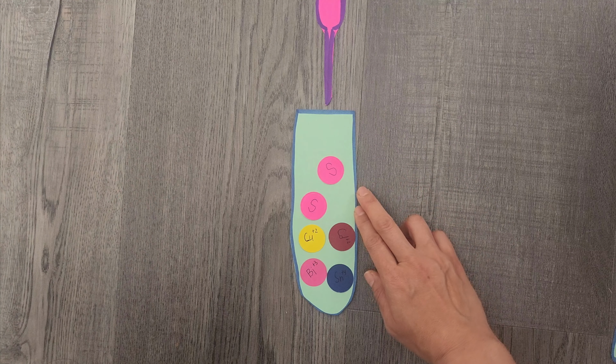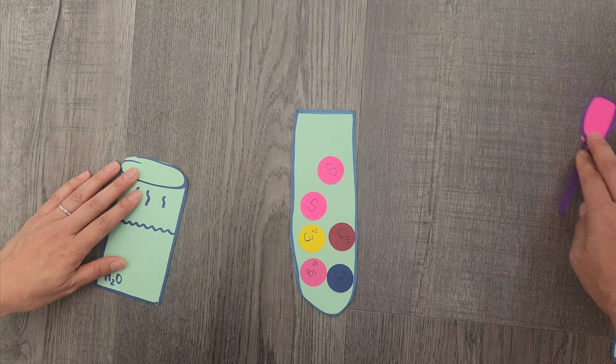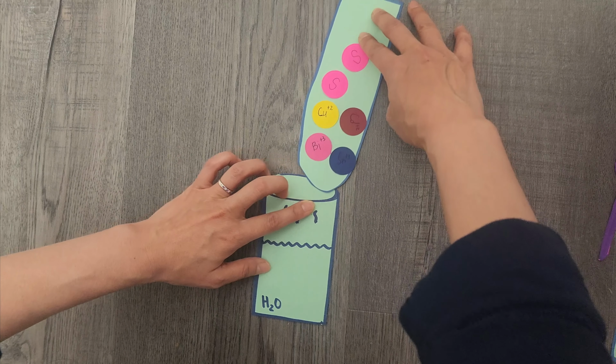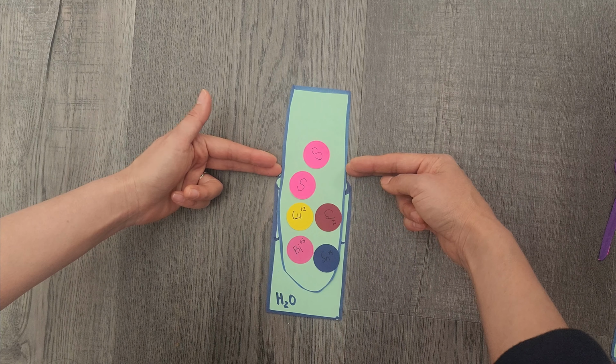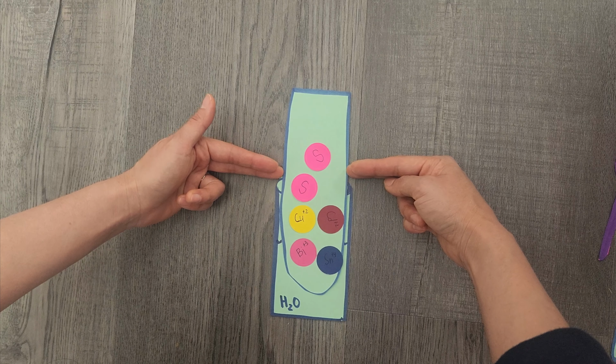Then you're going to take this and put it in a boiling bath for 10 minutes. Let me take this out. And then here's my water bath, and you're going to put this into the water bath for about 10 minutes. And then make sure you clamp it with the clothespin so that it doesn't wiggle around.